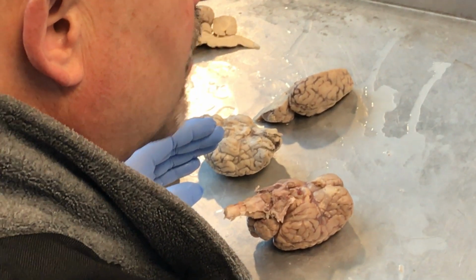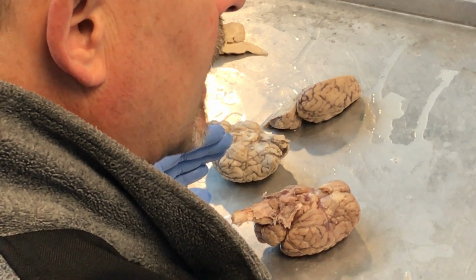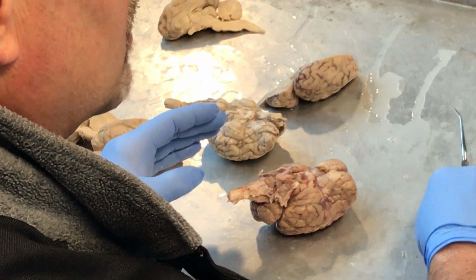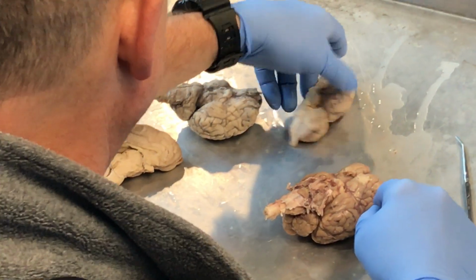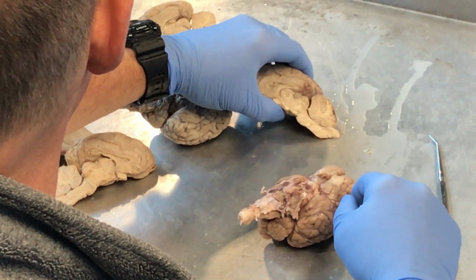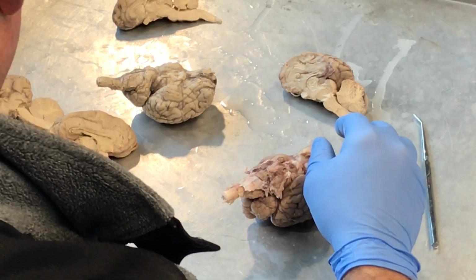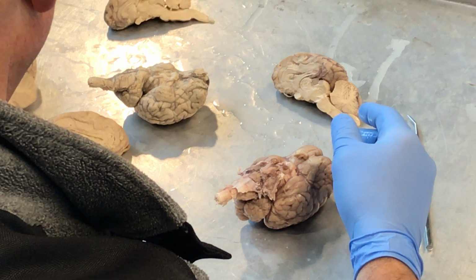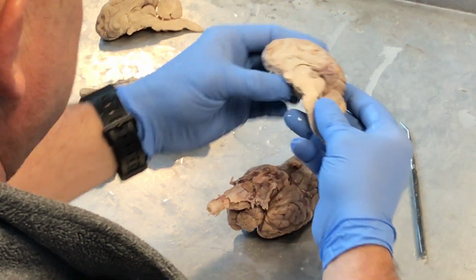We covered olfactory bulb, optic nerve, optic chiasm, and optic tracts, and later on you're going to see there's a bunch of nerves in here that we won't have you know. The next thing we want to go to is the hypothalamus. And the hypothalamus is below the thalamus. Hypo, below the thalamus. So let's see if we have a good shot of hypothalamus. This one's about broken. Alright, this one's not too bad.